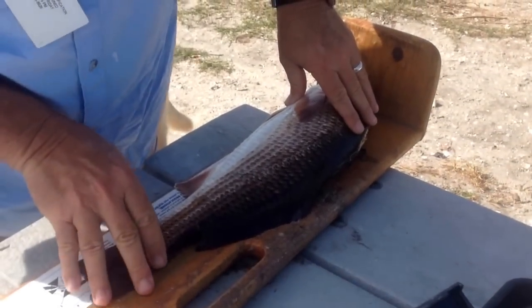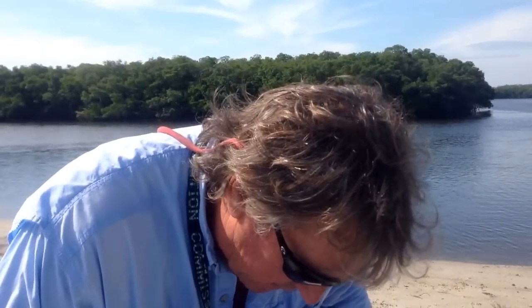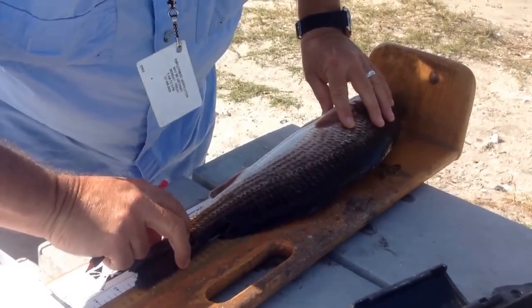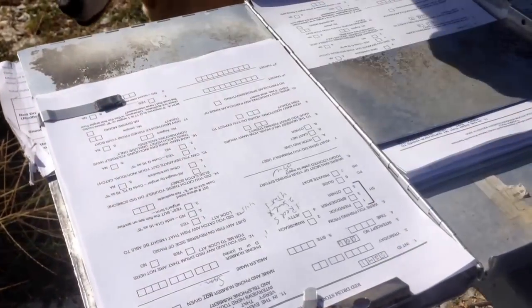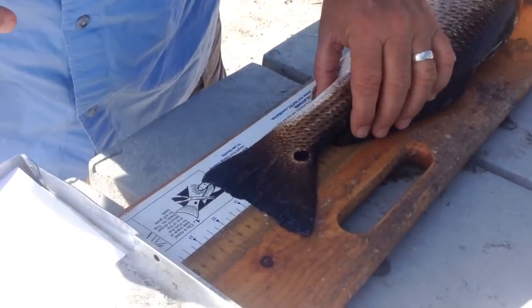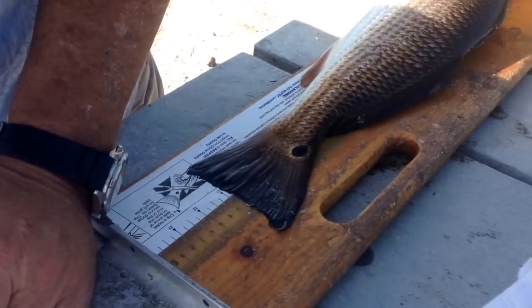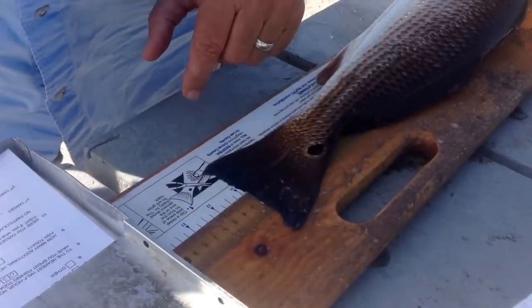He measures twenty-one and three-quarters inches. There are four measurements we get for the science end of it. The standard is the end of the skeleton right there — you can feel where the skeleton ends on the fish — and that's 345 millimeters. Then you get a midline which is 420, and then a total, which is splayed tail, that's 530.